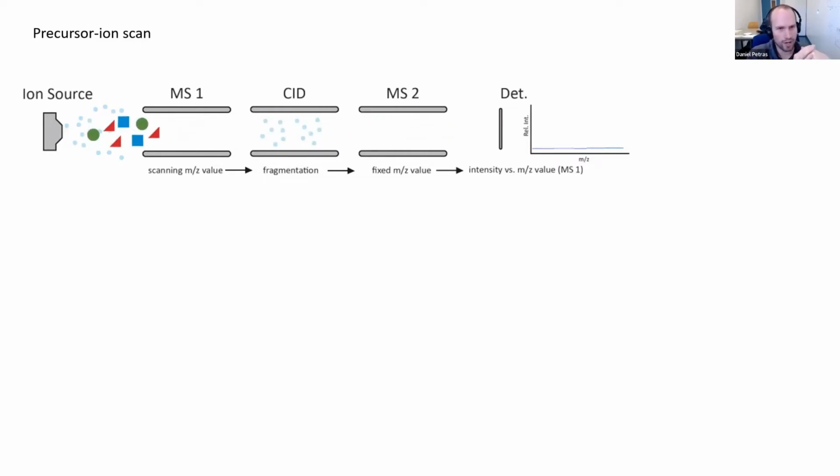And now I want to look at all molecules in my sample that would result in a specific fragment I would expect this amino acid to cause. That way you can screen quickly for potential molecules that fit your criteria, and then eventually make further experiments with them to identify what they are.